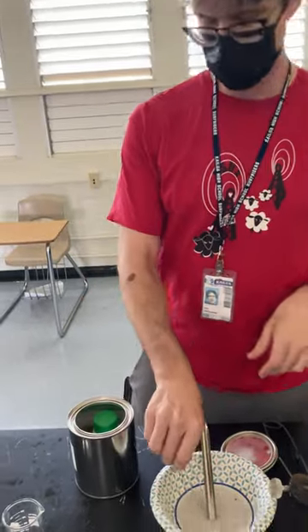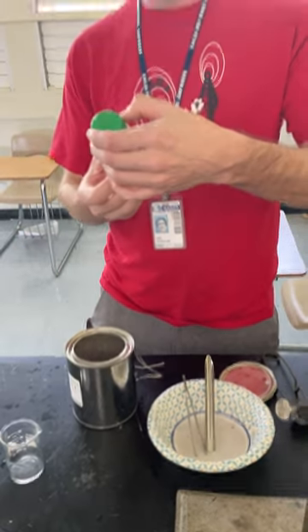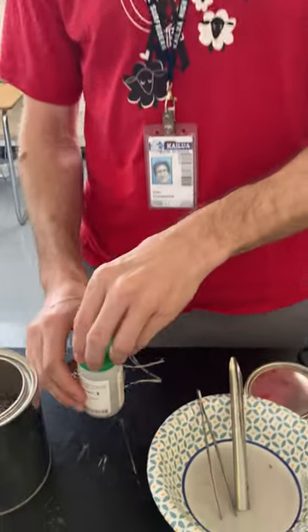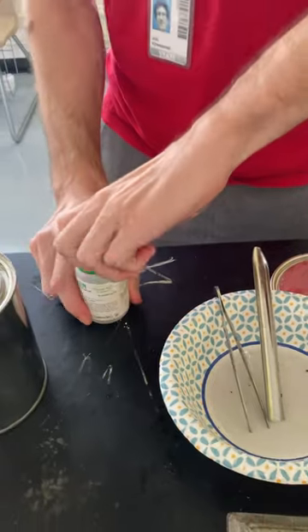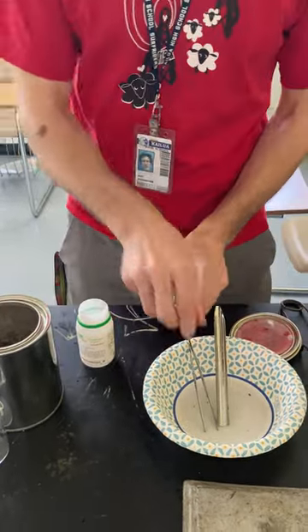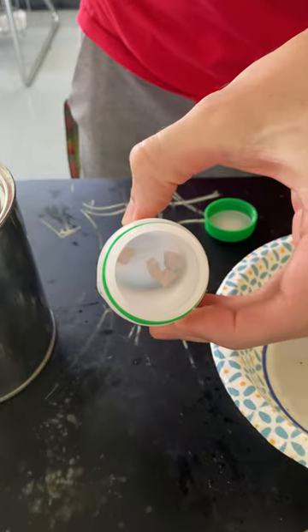So I have some sodium metal here, and it's packed in mineral oil — sodium metal packed in mineral oil. I'm just gonna show you here's how it kind of looks.